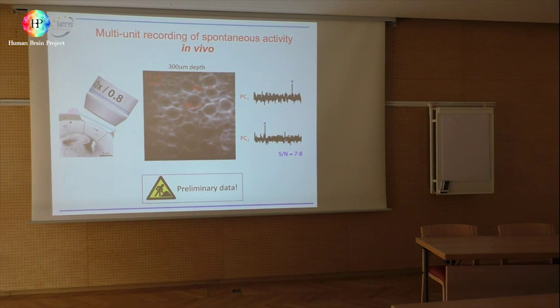Is it possible first to use a more superficial resolution, and then maybe to pick some neurons which would be of interest, and then zoom in and use only these neurons? Absolutely, yes. That's the way it goes. Exactly. Good.